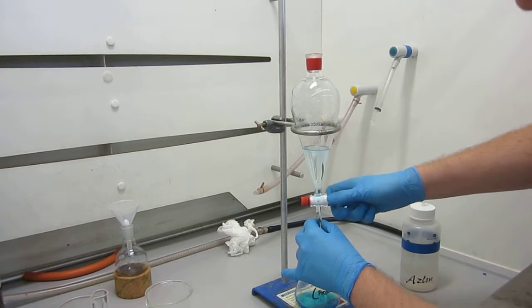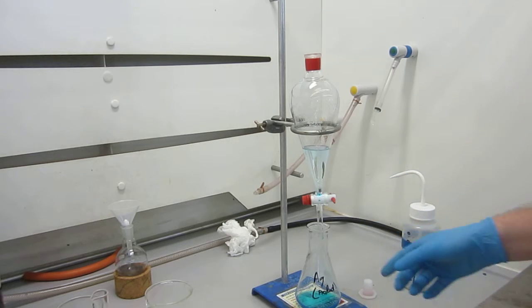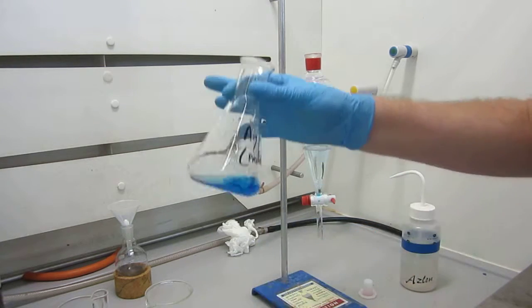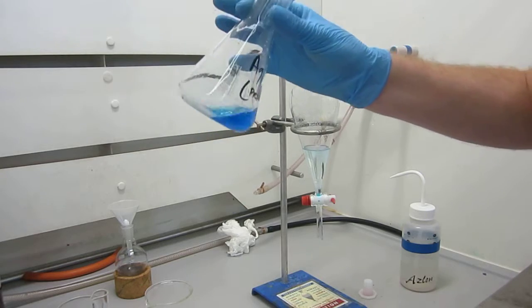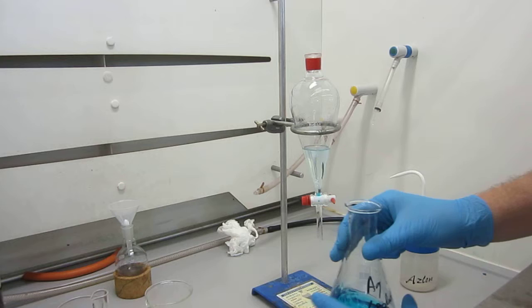There we go, like that. I'm going to stop a little bit short as well because I know I'm doing 2 more extractions. So there's my first aqueous layer, and you can see how it's very blue because it's got all the blue product in it now, which wants to be in the aqueous layer.